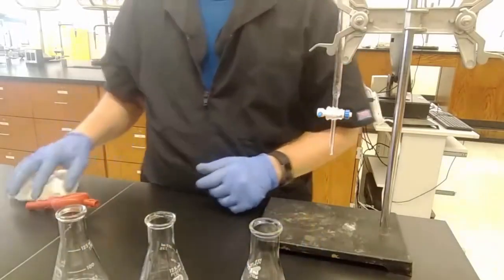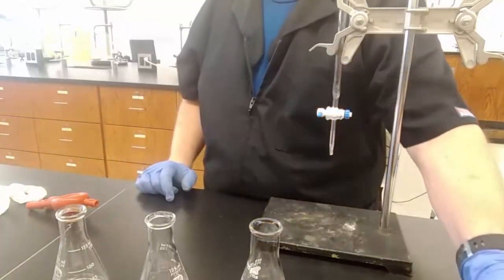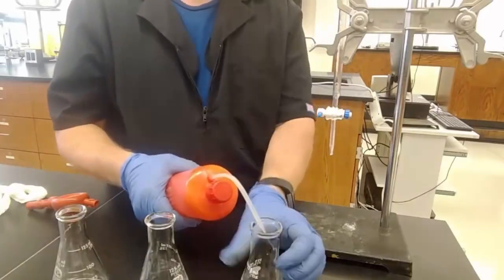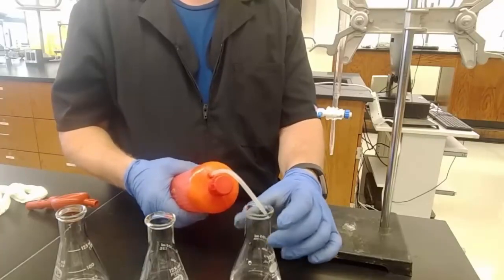So we have three flasks. The next step, we're going to add about 10 milliliters of deionized water to each of the flasks. How come? Because we want to just have a decent volume in there. And 10 milliliters can be a little bit challenging. So I can use my deionized water bottle to rinse down the sides of my flask.